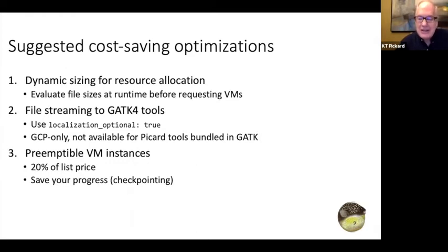Also, there are commands inside that specify how many times you restart before you give up and say, I'm not going to use a preemptible instance, but I'll actually pay full price. And at the Broad, they use the number 3. So after 3 times of being out at bat, if you will, it decides to use the full cost instance. So that's 3 ways to reduce costs as you're using this scatter and gather.